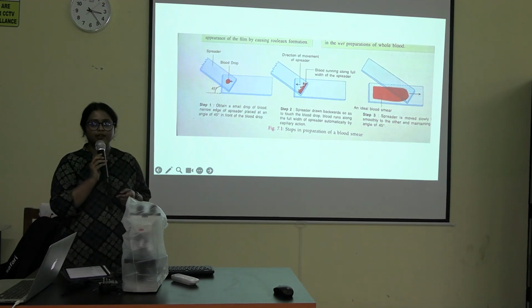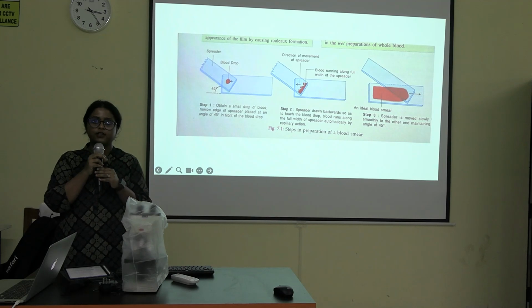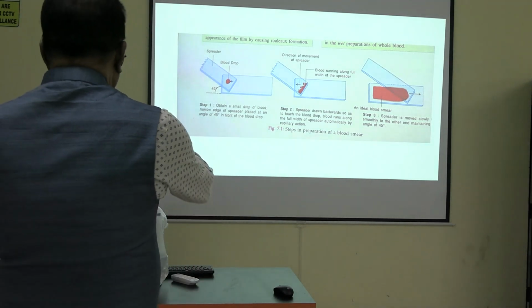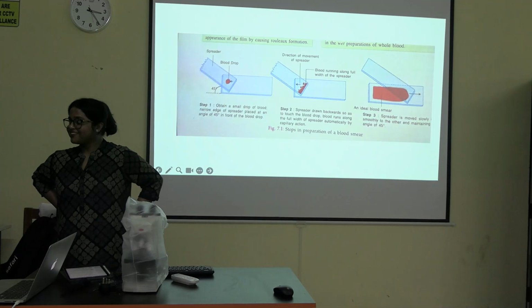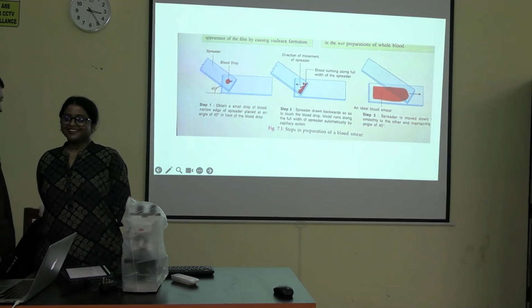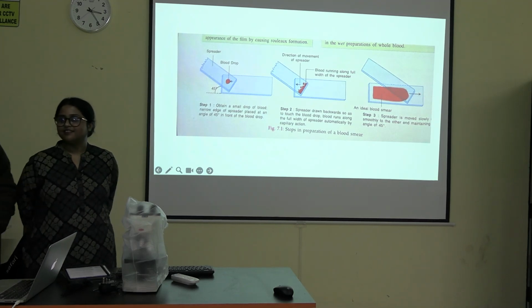One of the slides will be used as a spreader, only for the purpose of making the smear. You select the spreader first, and you just have to see whether the surface is smooth. It should be smooth. So this is one requirement for making a good smear.